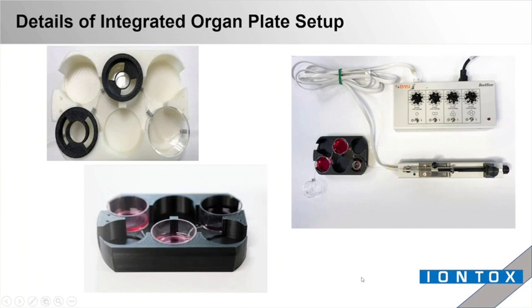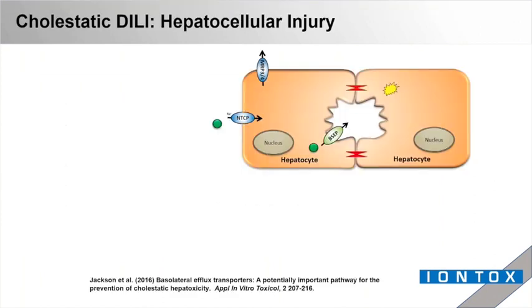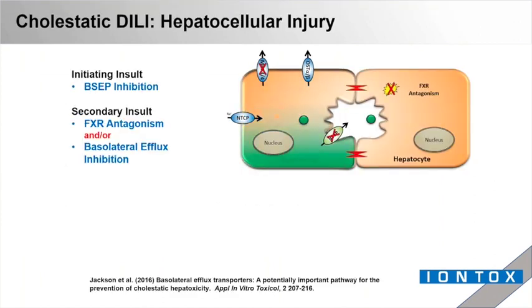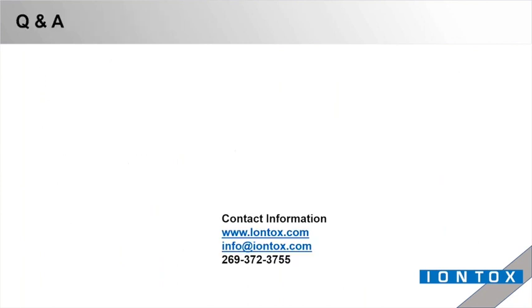Okay, I'm just waiting for some more questions. For Sayum, in terms of determining the tissue barrier integrity for the PAP experiments, can you talk about how you do that? Are you using TEER measurements or using a leakage marker?